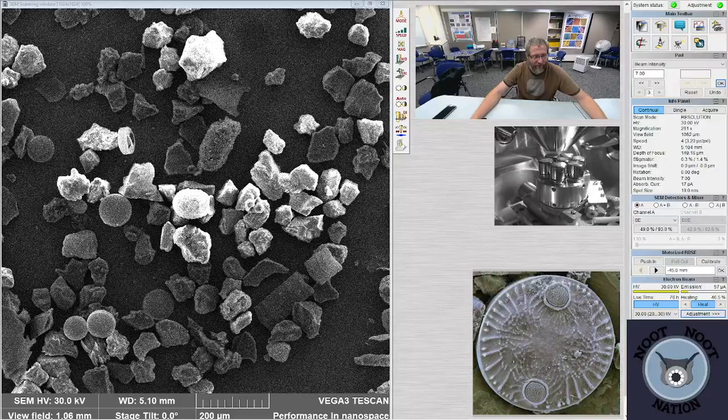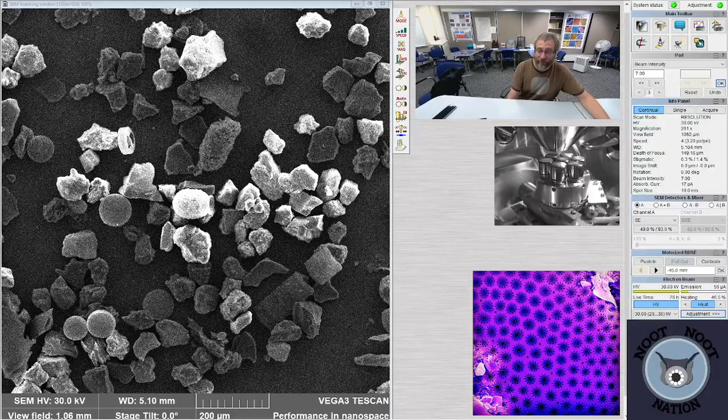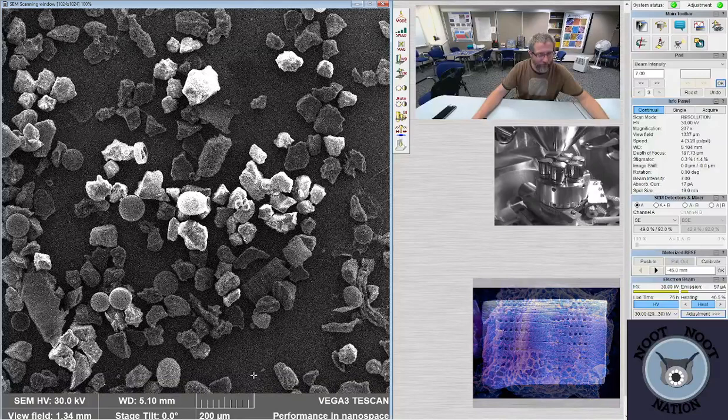How does she send you the samples? Is it just some drops in the mail? I sent her some centrifuge tubes and she usually puts them in those, but it could be in any container, really, that's waterproof. And then she just packs them so they don't get destroyed in transport. So wrap them carefully, basically. It's pretty easy.